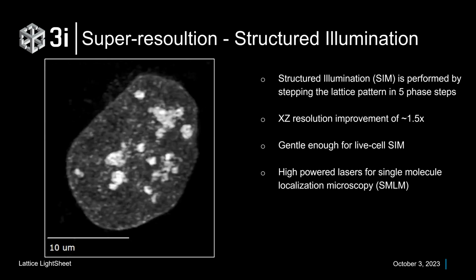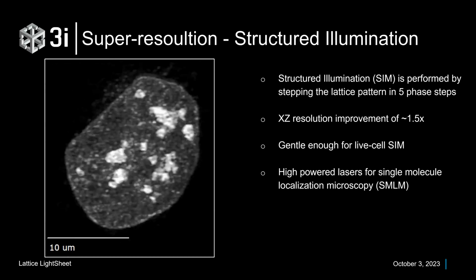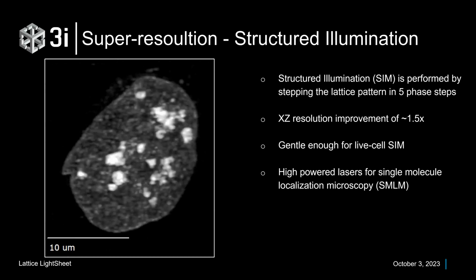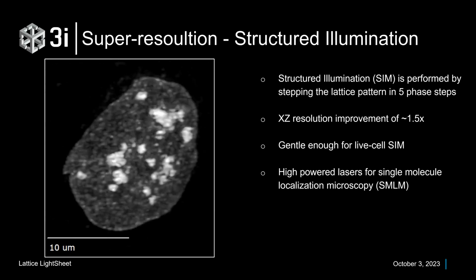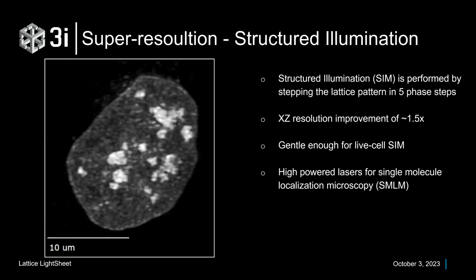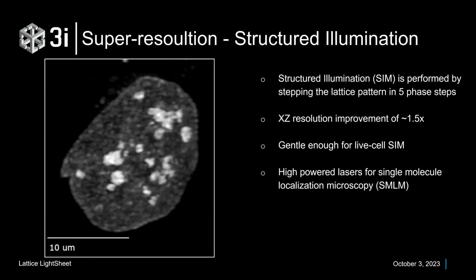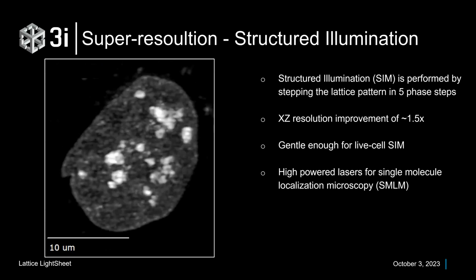It's a great question. I like to say traditionally take whatever your normal imaging is, and it's about 10 times slower for SIM. So it's 5 times for the extra images, and then I usually double the exposure time to give me that better signal and noise from going from a standard imaging experiment to SIM. So that does not work for everything, and I get that. SIM does take time to do.